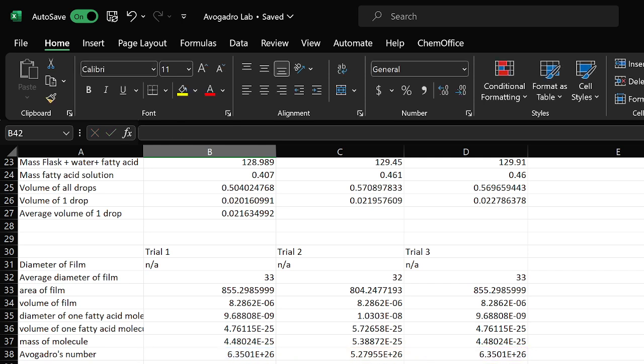Our value is larger than Avogadro's number by quite a bit, actually. That happens, though. Let me put a parenthesis on that, actually, so it's equals, minus, I'm sorry, not Avogadro's number. We do ours first because ours is bigger.